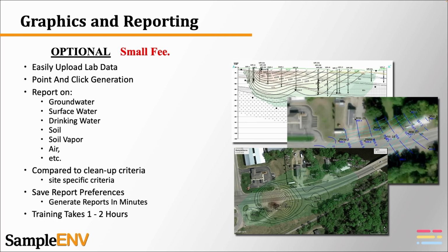Training on the reporting functionality is pretty simple. If a user has any experience at all in preparing environmental reports, most of those users will learn how to use this reporting software in under 2 hours. As mentioned, we do charge a small fee for the reporting service. Use of the reporting services is not required, and the field data and sample collection applications can still be used at no cost. The vast majority of users choose to opt into our reporting functionality because of the value and simplicity of the reporting product.